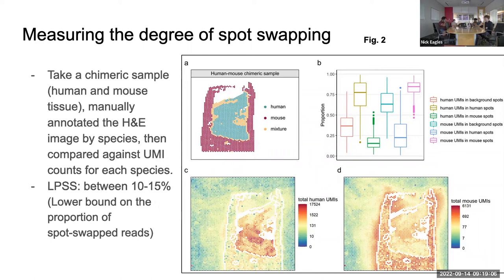They also introduce this metric they call LPSS — lower bound on the proportion of spot swapping. They typically measure this at around 10 to 15%, which is the percentage of reads in one species that are supposed to belong to the other. They call it a lower bound because this only captures cross-species spot swapping — you could also have spot swapping within the same species — so the problem is actually worse than they're able to measure with this metric.